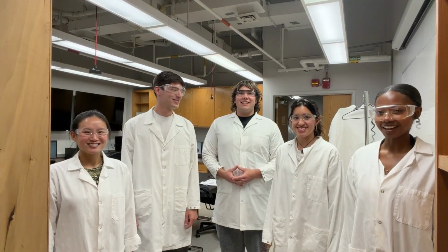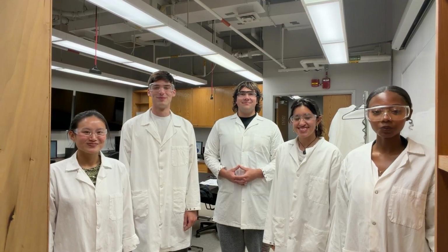Today we're going to walk you through some cool experiments we did this semester in 321. But first, let's put on our personal protective equipment, or PPE. And now that we have our personal protective equipment on, we're ready to go to the lab.